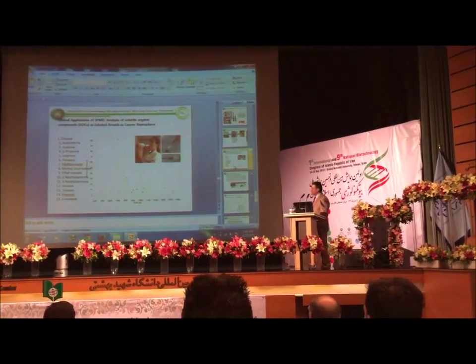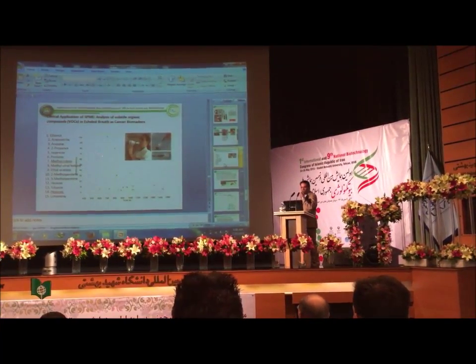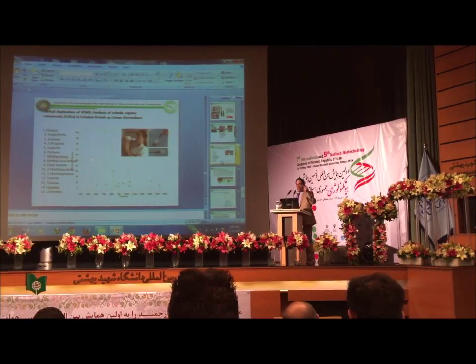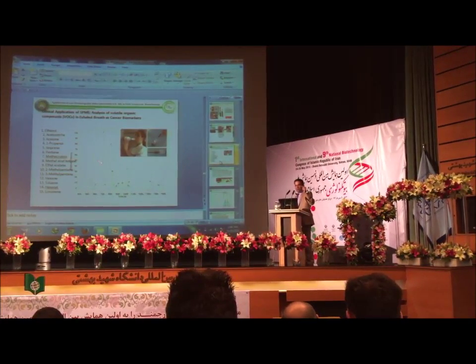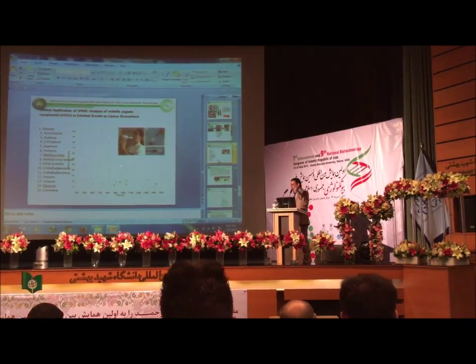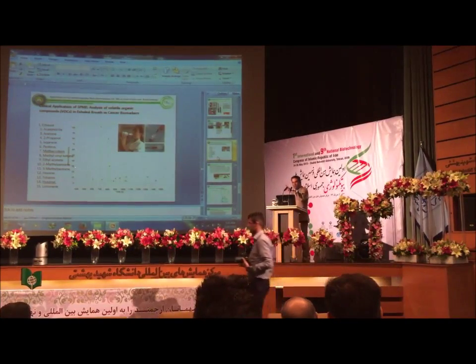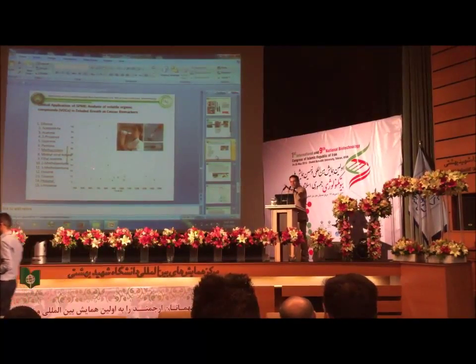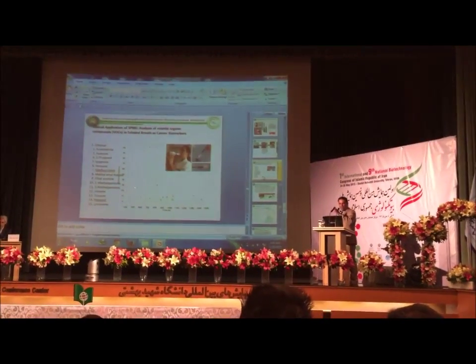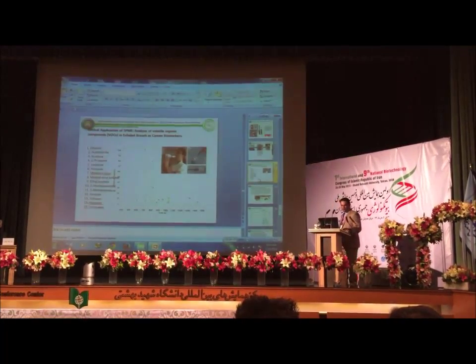Put the SPME in the mouth and detect the compounds in the mouth, because all the compounds are absorbed on the fiber. This fiber goes to the GC-MS and is treated by heat in the injector, and all these compounds become volatile and go to the mass spectrometer. We can use it in clinical settings; this technique is widely used.